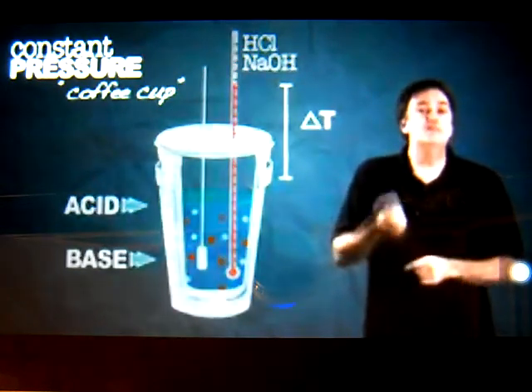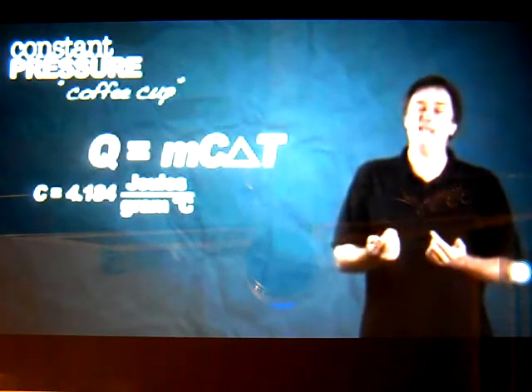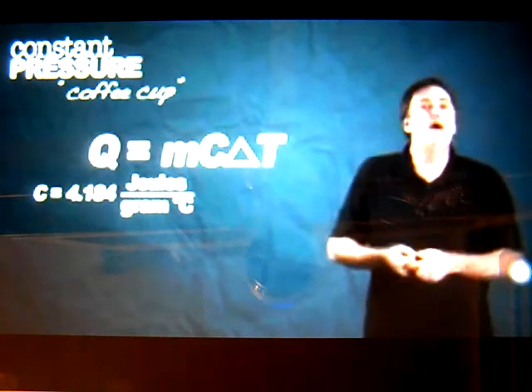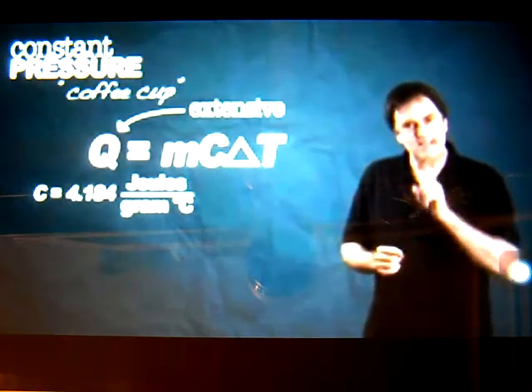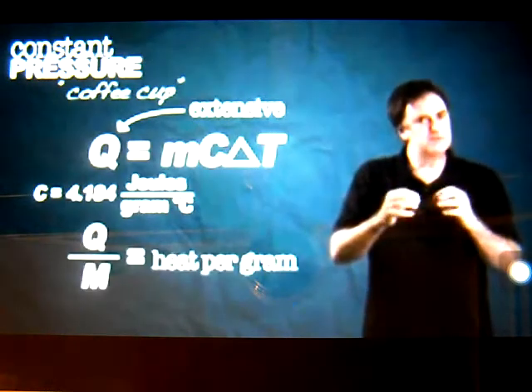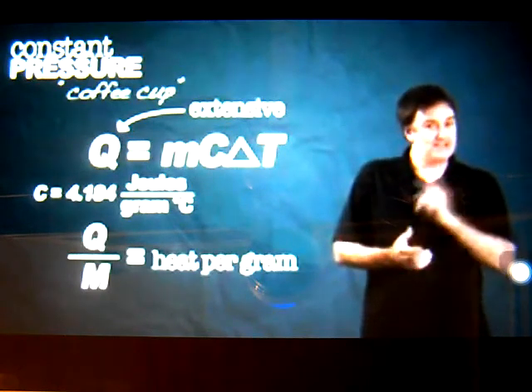From that delta T, you simply multiply that by the heat capacity of the water, which is 4.184 joules per gram per degree C, and you multiply it by the mass of the water, which you can easily weigh by sticking it onto a scale. Put all that together and you've got your amount of heat, which we call Q. That amount of heat is what was released from the reaction. That's an extensive property. We know the amount. Now you divide it by how much stuff you used, the amount of heat per gram or heat per mole, and you've got yourself the answer to the actual reaction you just ran. That's coffee cup calorimetry. Easy, cheap.